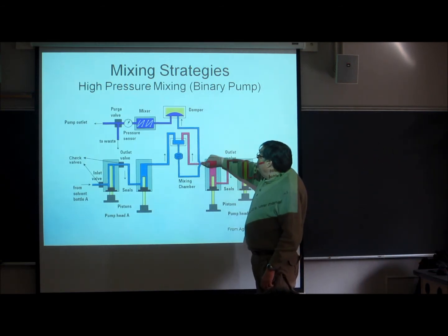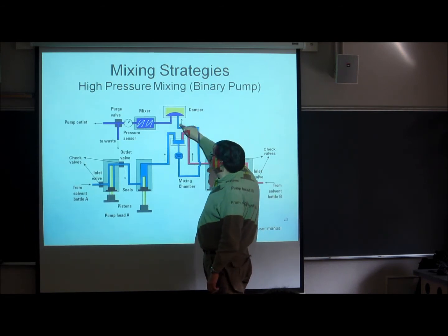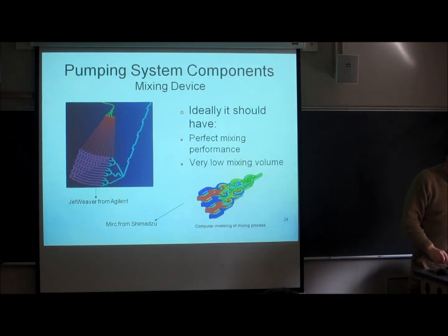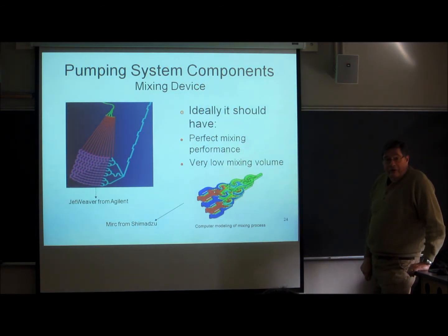This is a mixing chamber, and then a final mixer up in here. So there's a mixer and a damper and whatnot. All right, so this is a more complicated instrument. This is a cutaway view of a mixer. And I was amazed when I first saw these things up close.